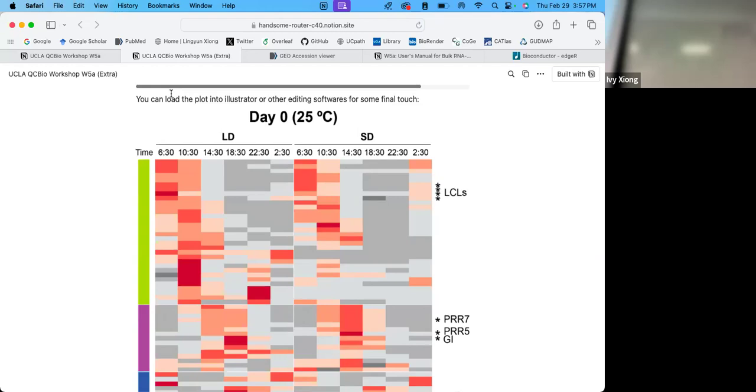So let's give it a try. Those things are going to be too much, so hopefully. But yeah, for this, I think more is more for you, just looking back at what we found. I'll report the whole thing. And they're both points, so it's okay. It looks really bad.